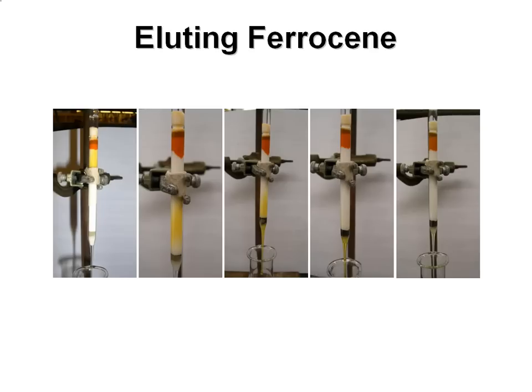Okay, so here is an example of a reaction mixture of ferrocene and acetylated ferrocene. This is a different kind of column. This is not exactly the same column or same solvent system that you'll be using, but just to show this reaction has been done with different reagents, and the separation can be done in a variety of ways.